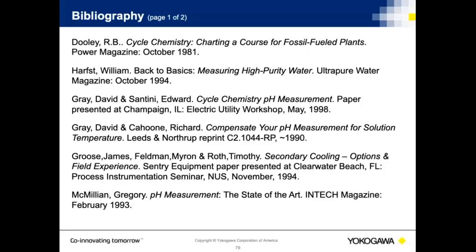As far as rejuvenating a measuring electrode, no, there's nothing you really can do. Once the probe is aged, if you look at the actual superstructure, how that glass is made and how it's formulated with different compounds like lithium, and once those compounds are upset and dissipated, your pH probe is pretty much shot, your measuring probe is pretty much shot.